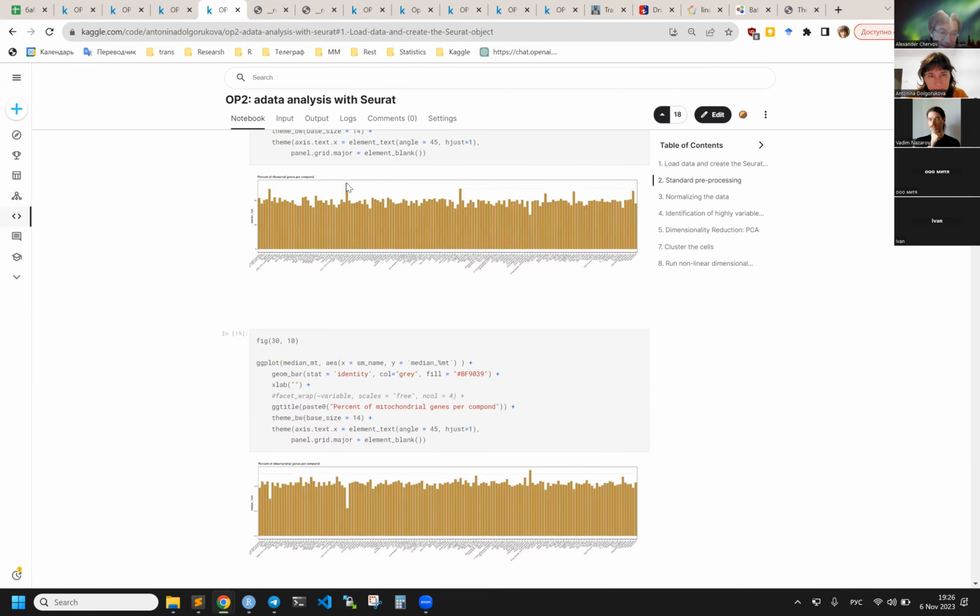But in this case, that is compatible. On the other hand, we can expect that if there is this negative control, then cells should be in healthy condition, and we should see more ribosomal and less mitochondrial genes. But since that doesn't happen, it's difficult for me to interpret. Yeah, for me too. Maybe it's just coincidence. I don't know.